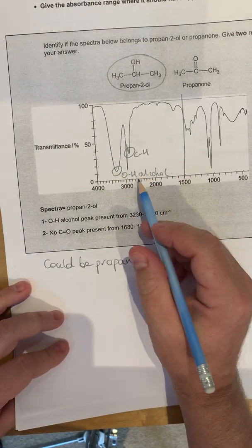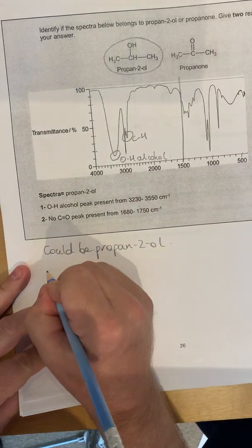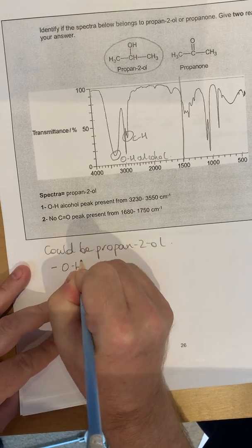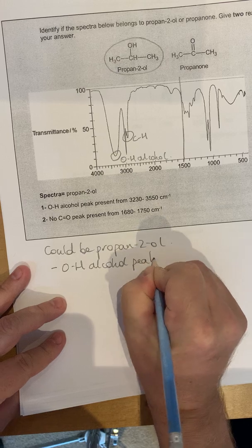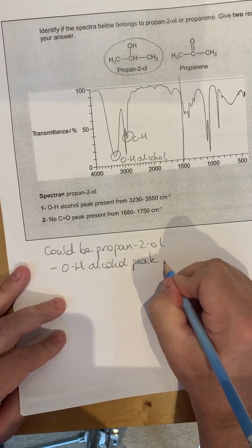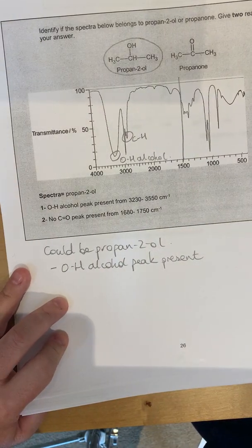So whenever you're talking about the presence of a peak, you firstly must state that the peak is present. So you would state that there is an O to H alcohol peak. So you're stating the bond and that it's present, because we can equally talk about peaks which are absent.